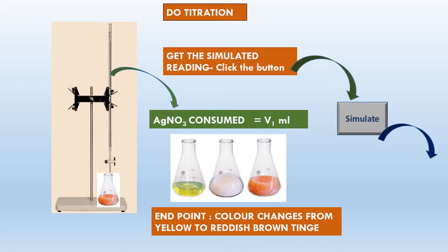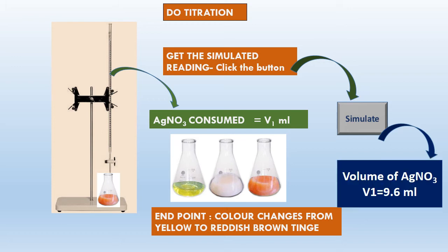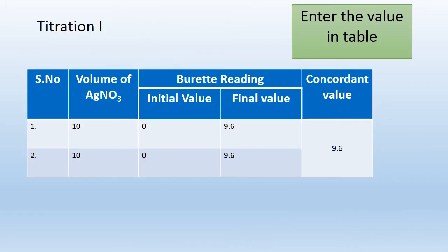Now let us note down the AgNO₃ consumed as V1 ml, and get the simulated reading by clicking the simulate button. Students, get ready to note down the values. Volume of AgNO₃, V1 is 9.6 ml — this is common to all students because we have given the same AgNO₃ to all students. Let us enter the value for Titration 1 in the tabular column. For concordancy, we enter the value 2 times.